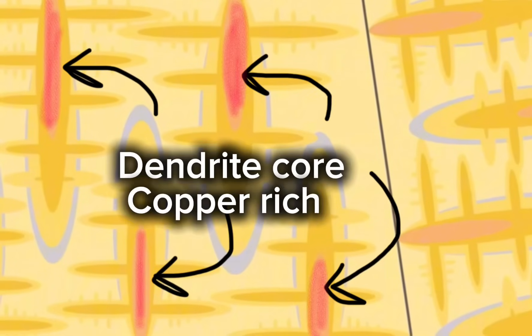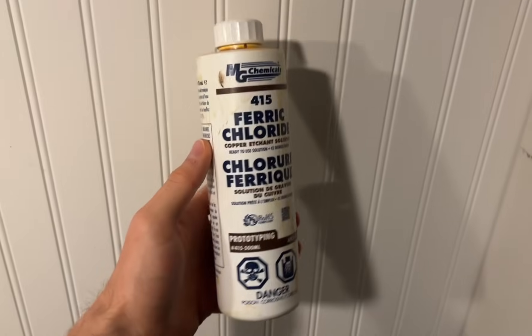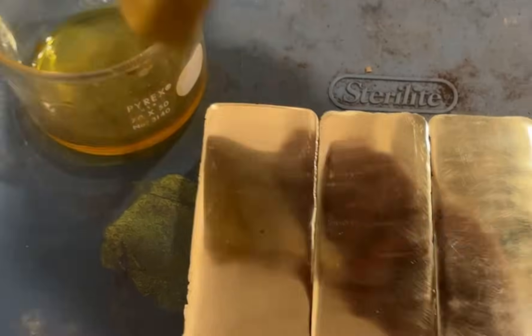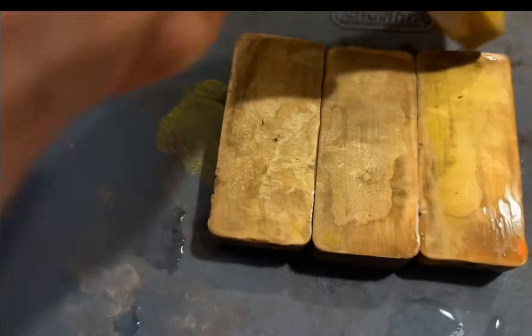The core of the dendrite is very copper-rich, as it is some of the first solid to solidify, while the outer shell of the dendrites as well as the spaces between dendrites are zinc-rich, as it is some of the last liquid to solidify. Using this difference in concentration, we can use etchants to selectively attack regions. For brass, a common etchant is a ferric chloride solution, which will selectively attack zinc-rich regions. And so you can see, as I apply the ferric chloride solution, the surface of the ingot becomes a lot more textured and we start to see that dendritic structure, as the zinc-rich regions are attacked and the copper-rich dendritic cores are spared.